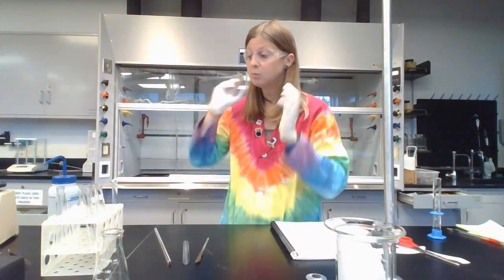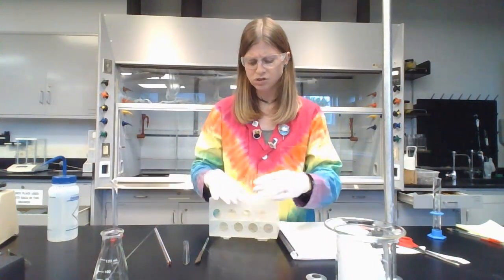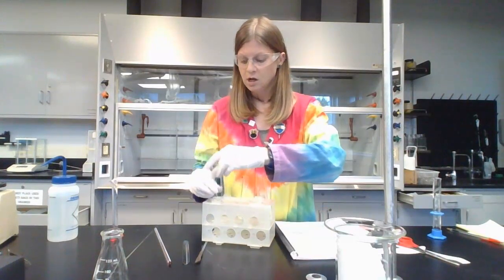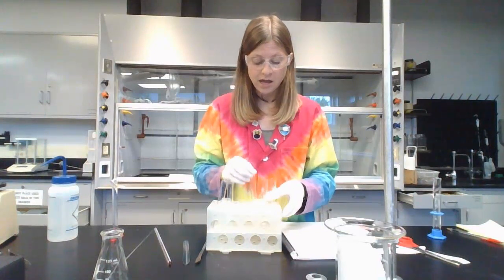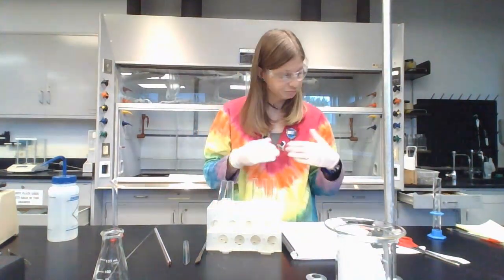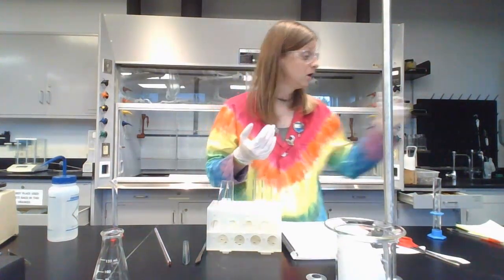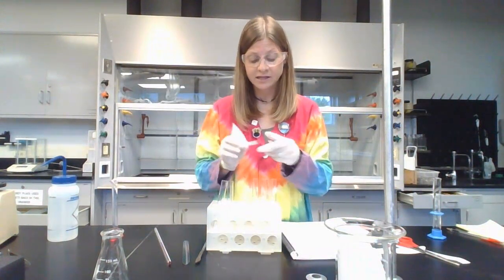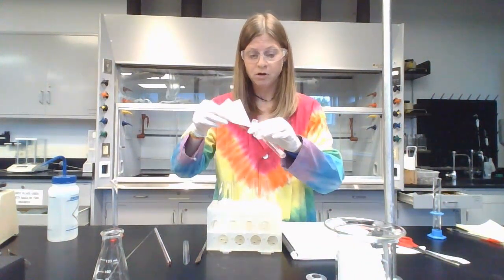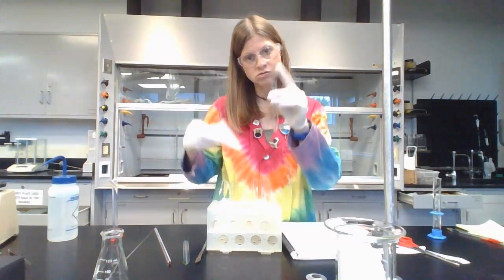So next we need to start preparing our chemicals that we're going to test. So you will have already used 2 test tubes to do a color test. What we're going to need is 3 more test tubes at this point, okay? And you're going to go back and get some of that pure aspirin and that pure salicylic acid. So using a piece of weigh paper, you're going to measure out about 0.01 grams of salicylic acid, and then pour as much of that as you can into the test tube.